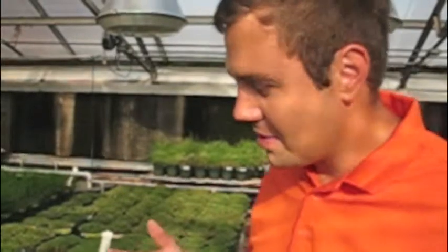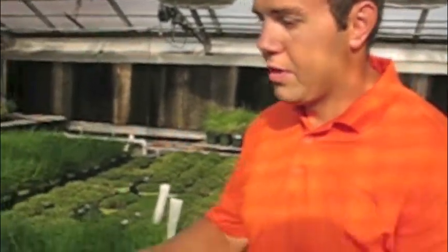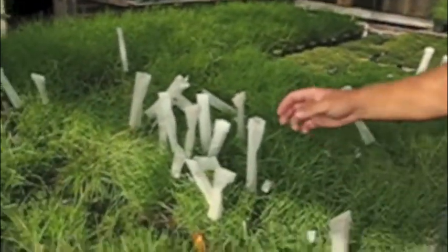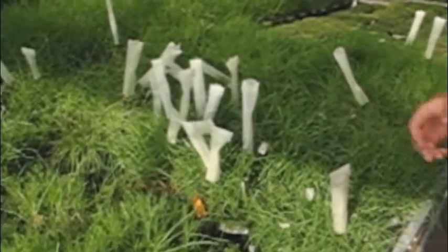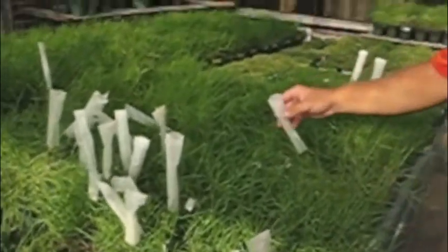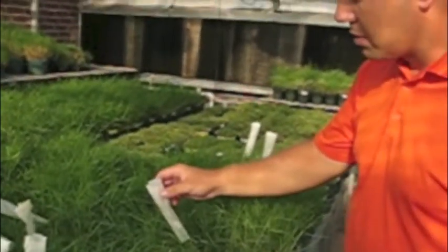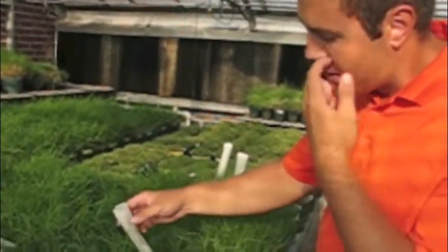Today's date is July 25th. Once we're done making crosses for the day, we go through and look at all the bags — either crosses have been made or we covered them up the day before to see if stigmas will emerge on new seed heads. Here we found a bag that says July 14th, which has been over a week, so we can go ahead and remove this bag.